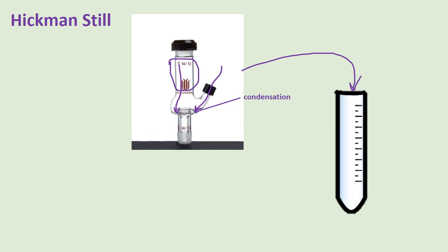Because it's a mixture of oil and water at this point, you should see layers separate out, much like you saw for the spinach experiment in the centrifuge tube, or when you did the acid-base extraction experiment. And you will then perform the rest of the workup that's described in this centrifuge tube.